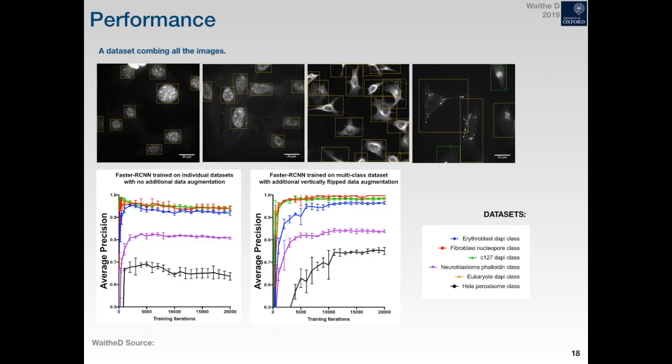As part of this, I'm creating data sets that you can just use and add to your data as well, so that when you come to train it and use it, you've got this data to help pad out what you've got. So this will add an extra few percent to the accuracy as well.